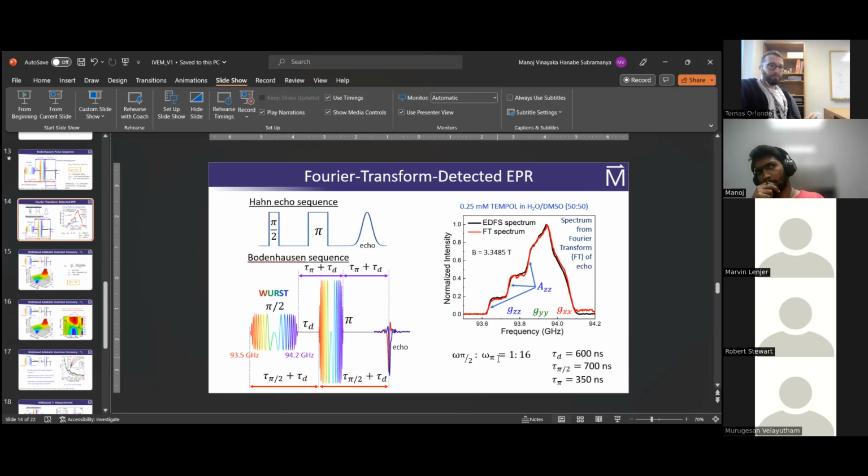Yeah, well, maybe. I mean, the wonderful agreement you get between the field swept Hahn echo sequence and the Fourier transform is very, very impressive. I'm not sure we ever saw anything quite so good. And if you haven't looked at it, then that's fine. It might be interesting to have a look at, though, it's just a comment. Yeah, thank you. I will look at it.